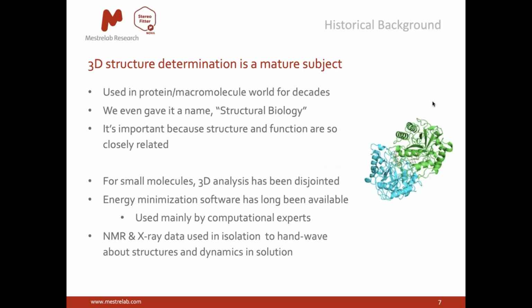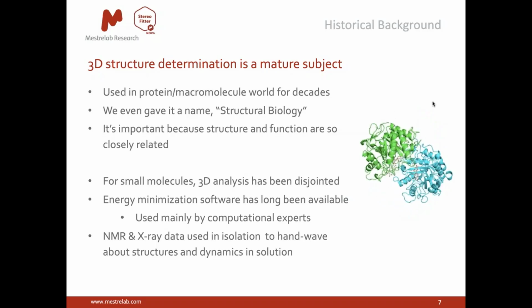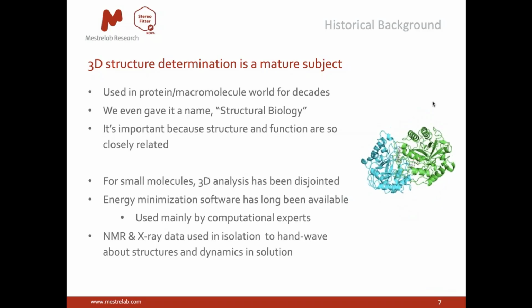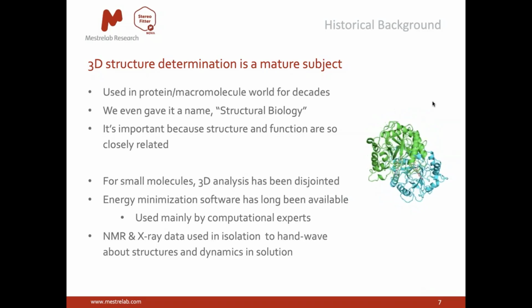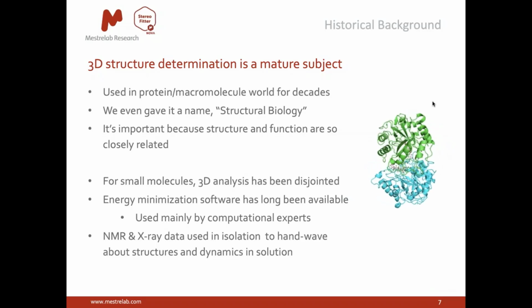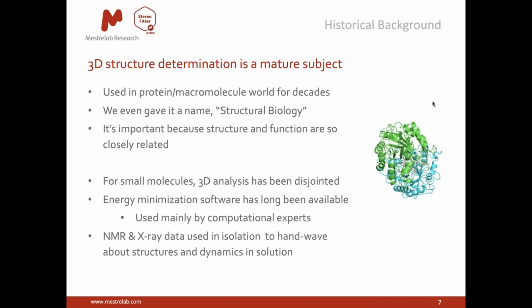So let's start with some context. Scientists have been trying to determine the 3D structure of molecules, large and small, for a long time. Methodology evolved rapidly as NMR magnets got larger, NMR spectrometers got more powerful, and computing power exponentially increased in capability. In the world of macromolecules, we even gave it its own field of study, structural biology. Breakthroughs in medical science have come about in many ways due to the relationship between structure and function.